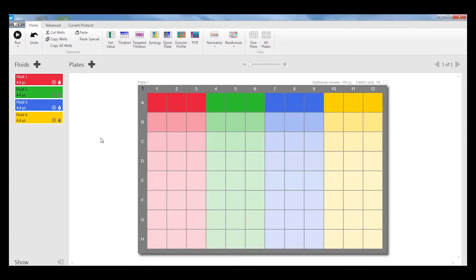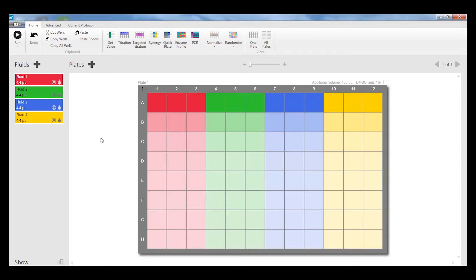I'll start with a plate that has four fluids dispensed as eight-point triplicates, and each of the different concentrations of the compound in this plate have different amounts of DMSO dispensed in each well.